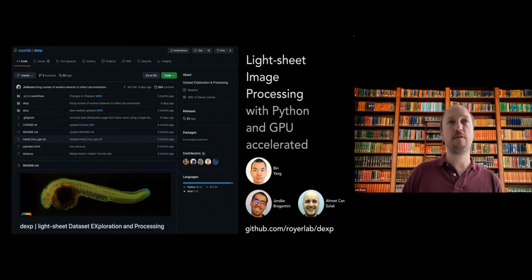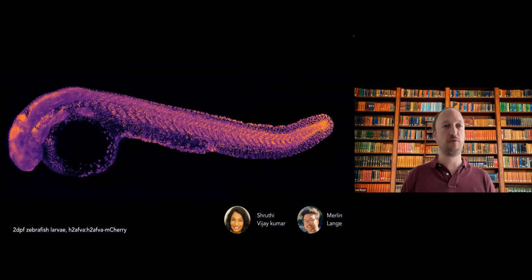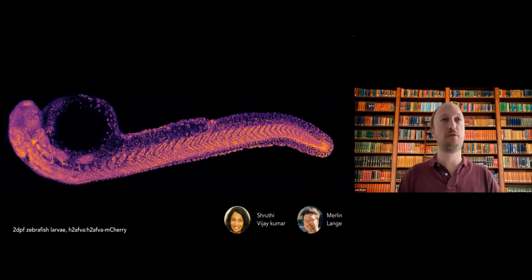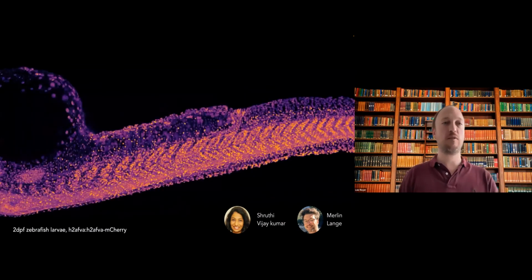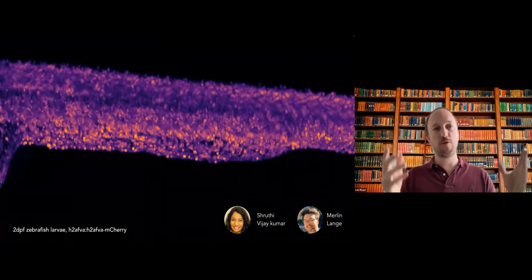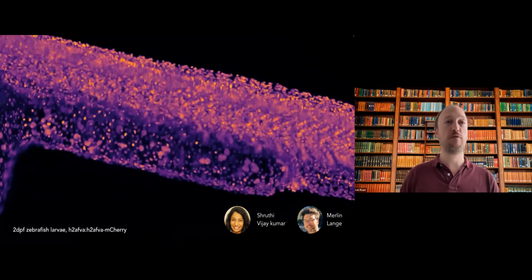But another fantastic thing is at the end of the processing, once you have this Zarr file that is fully processed, then you can really visualize it with Napari. And again, with Napari animation, you can just render it on the screen interactively, or you can generate your MP4 for your publication. So these are actually videos that we generated directly from that. So you don't need necessarily some of these very expensive commercial software packages to make very complex animations. You can actually use Napari very successfully for all that.